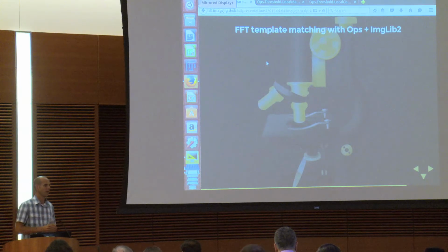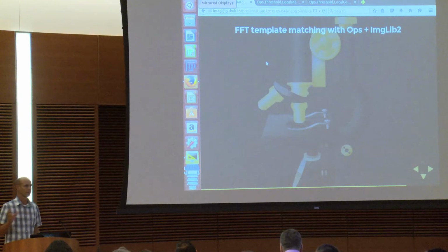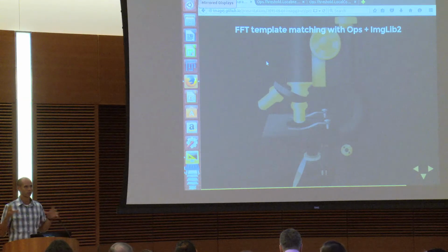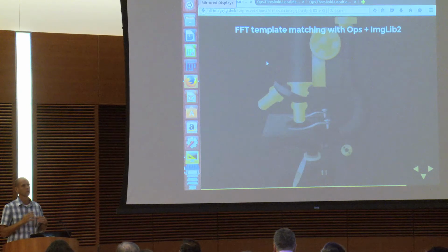ImageLib2 and some of the plugins that are written using it are really powerful. One of the purposes of ops is to access a lot of these little utilities. Like the TrackMate plugin had a lot of cool utilities for reducing noise and pre-processing these noisy, spotty images, detecting spots before doing the tracking. But before ops, it was possible to use them in a script, but harder. So the purpose of ops is really to simplify.